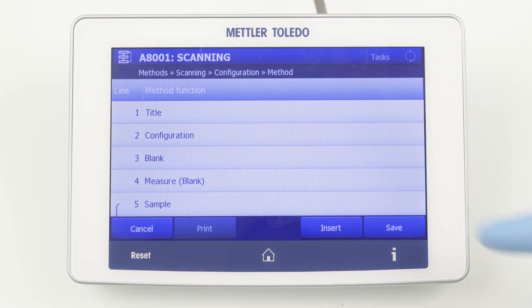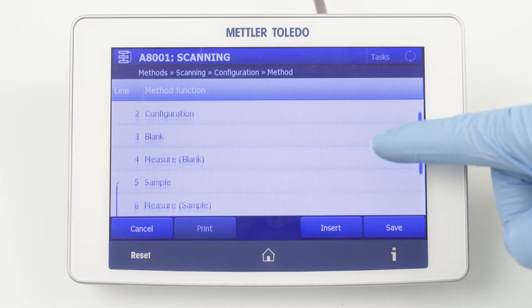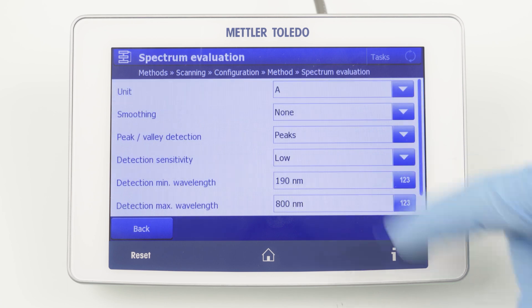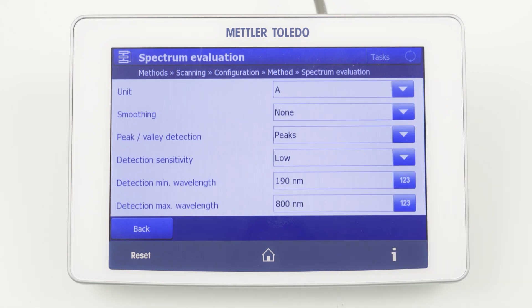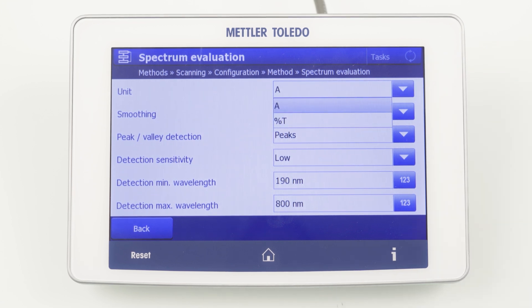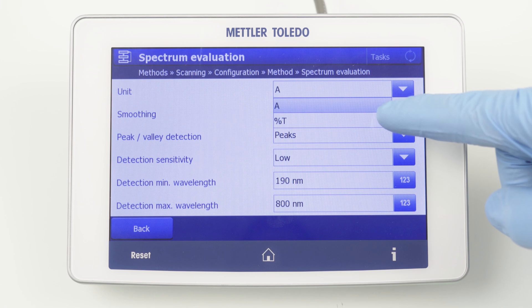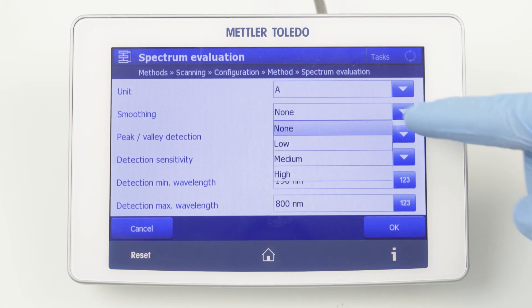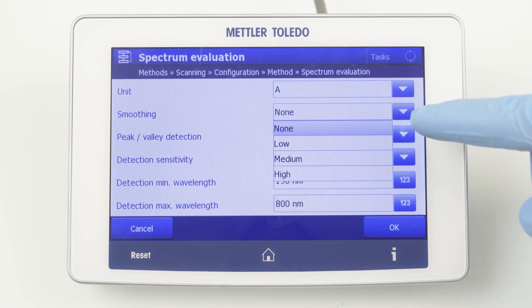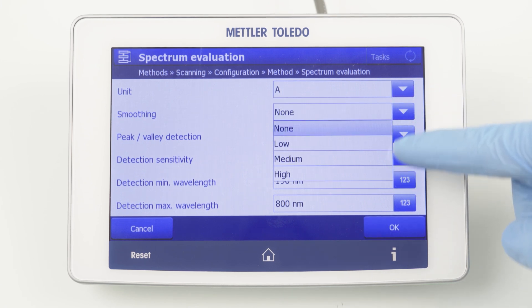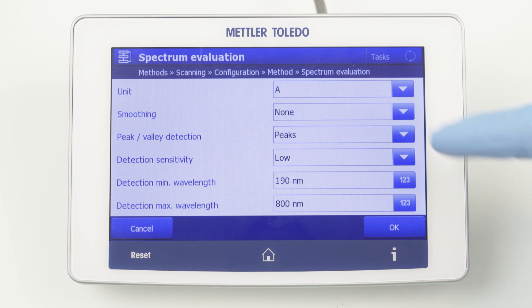The analysis tools, such as peak finding or smoothing, can be found under Spectrum Evaluation. Here we can select the unit of the spectrum — absorbance or transmittance. With smoothing, different degrees can be selected: low, medium, or high.